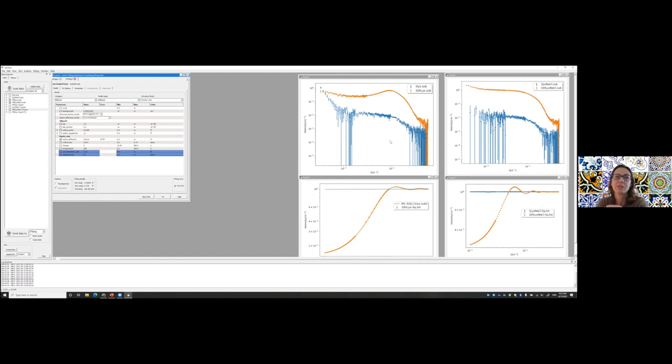Your protein will have solvent-filled cavities. It will also have hydrophobic cavities. So what neutrons are seeing could look different. But also, especially in the case that we see here for the no-salt condition, if there's some aggregation, and if you're not rotating or agitating your sample while you're measuring, you could have some of the protein precipitating at the bottom while you're measuring.